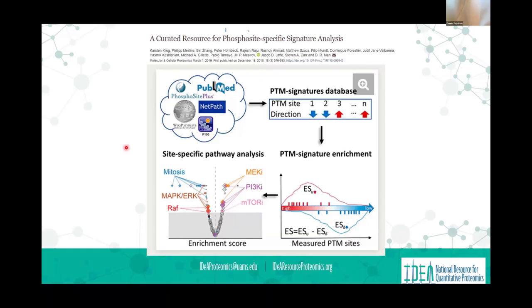It's easy in a TMT experiment to compare, because remember, these are the ones that have the individual labels and they're mixed together. So in one scan of the mass spectrometer, you can really read out the phosphorylation differences on that peptide.